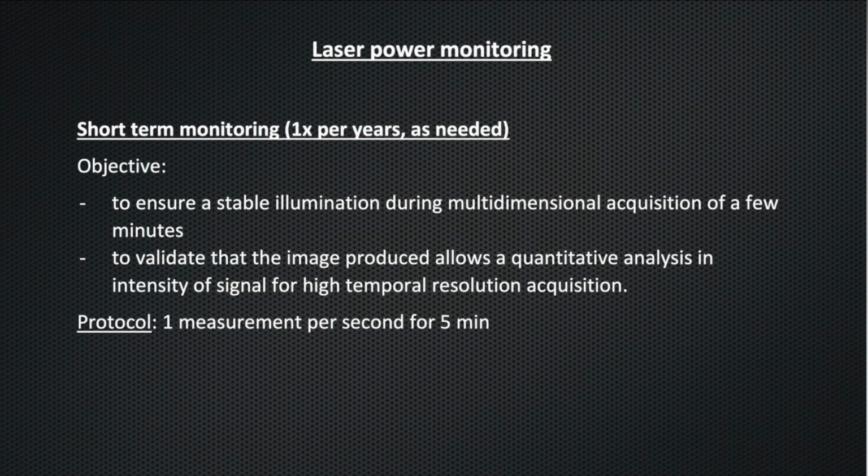The aim of the short-term monitoring is to estimate the possible fluctuations in illumination during fast time-lapse acquisitions during a short time period. We want to validate that the produced image allows a quantitative analysis in intensity of signal for high temporal resolution microscopy as FRAP techniques, for instance, or multidimensional acquisitions as mosaics or Z-stacks.